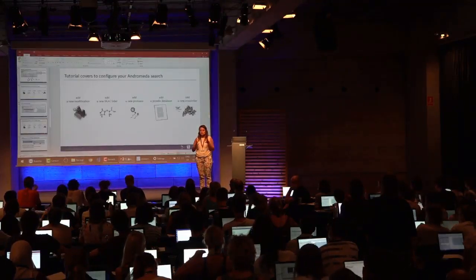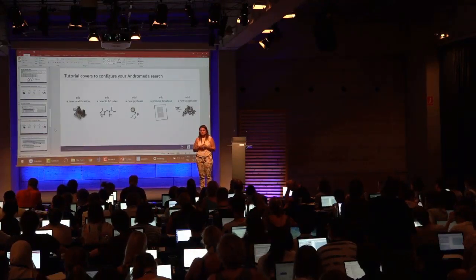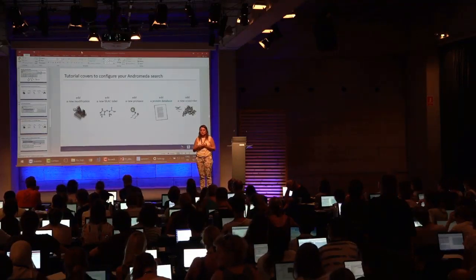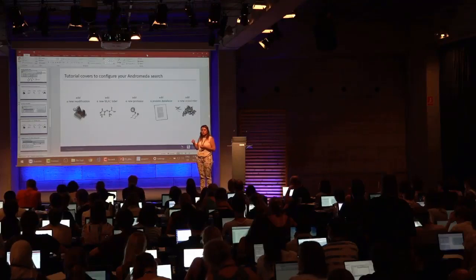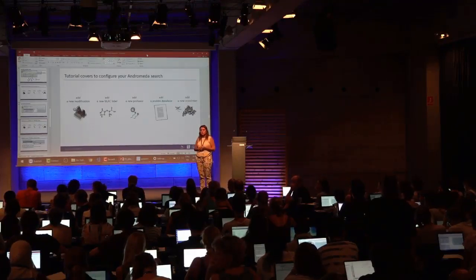So you have a new protease that cuts at the C-terminus of aliphatic and aromatic residues. You can choose on the table which residues you want to add and select them. Okay, so you would suggest doing that rather than a semi-tryptic search.